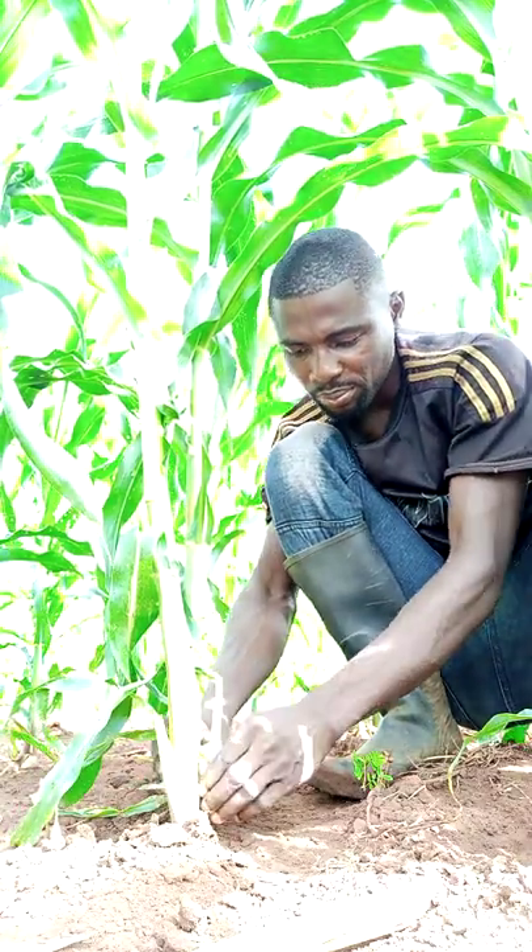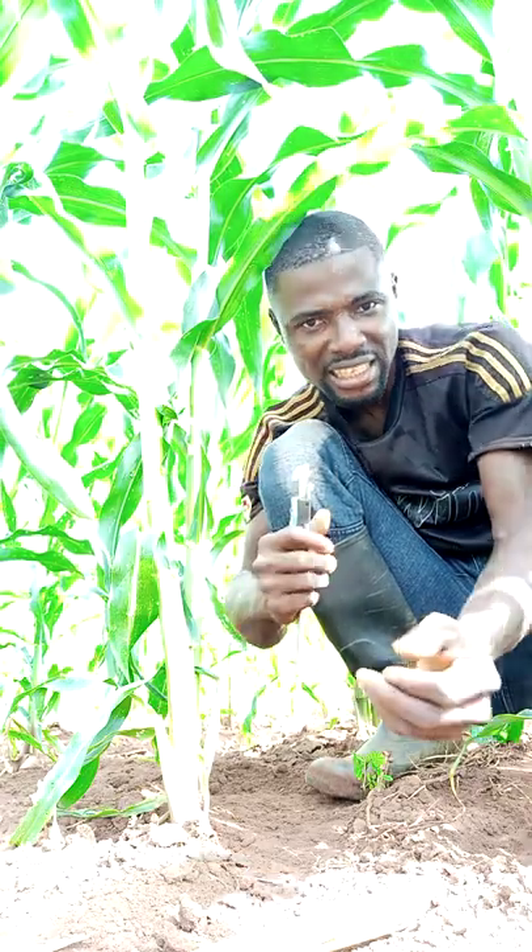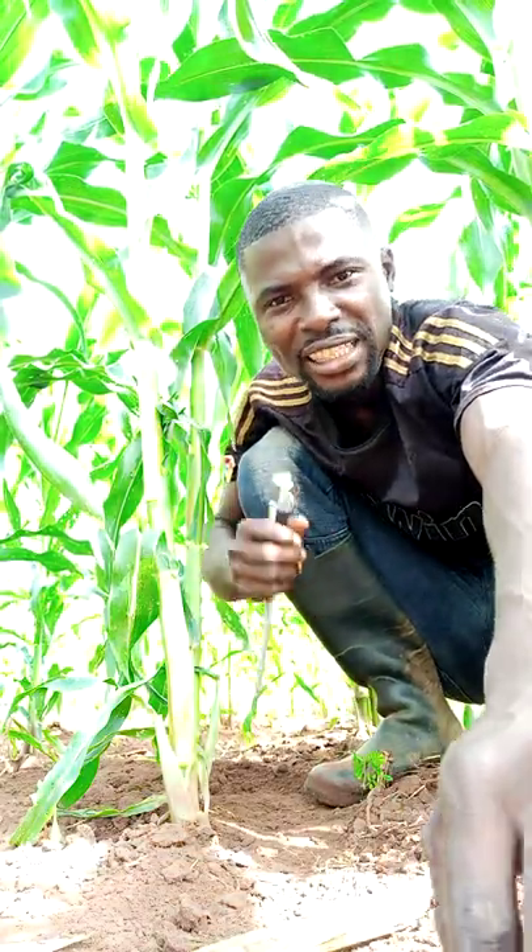Let's look at the stem diameter of the other one. The stem diameter of this maize plant is 2.01 centimeters. That is how we take the readings, or that is how we measure the stem diameter of a maize plant. Thank you once again.